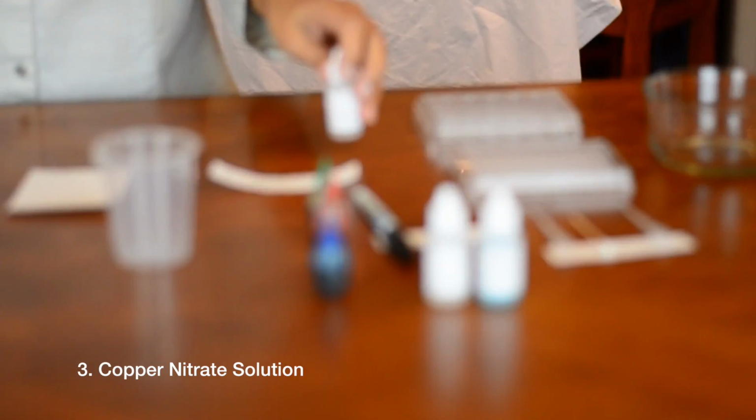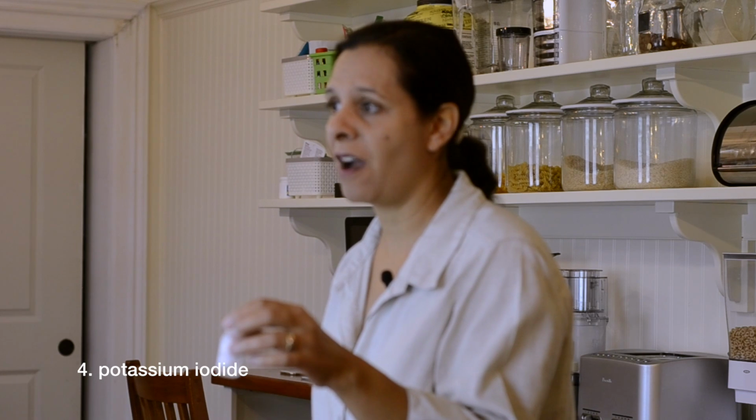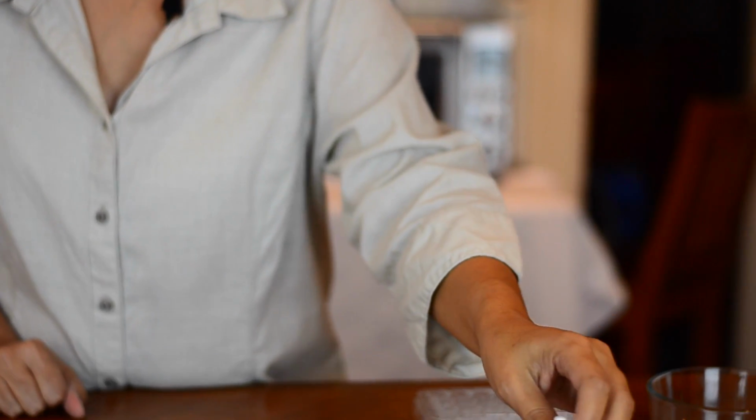We are going to be mixing those together in a solution and then using our paper chromatograph to separate the components again. Potassium iodide is what we're going to use after to develop our paper chromatograph. So make sure you keep your solutions straight so you're not getting them mixed up.